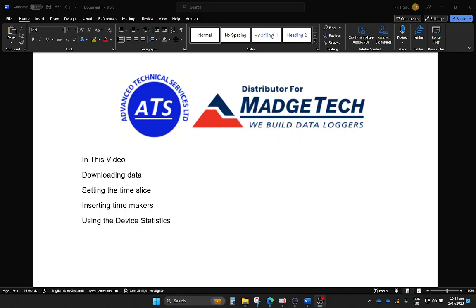Hi, it's Phil from Advanced Technical Services, and in this short video we're going to go through downloading data from the data loggers, setting the time slice, inserting the time markers, and using the device statistics. We're going to do this with a vacuum test on an autoclave for help getting us some information. So let's get started.